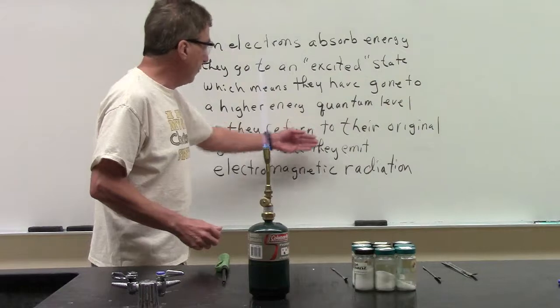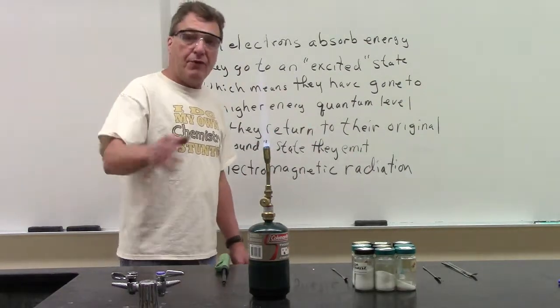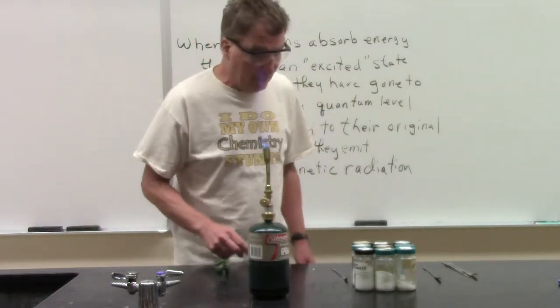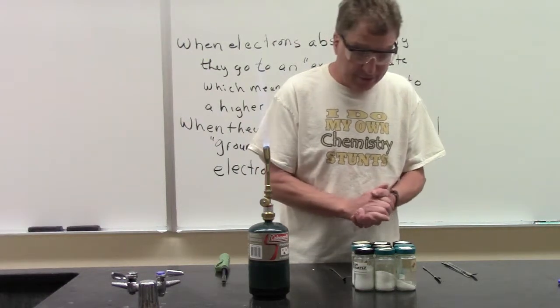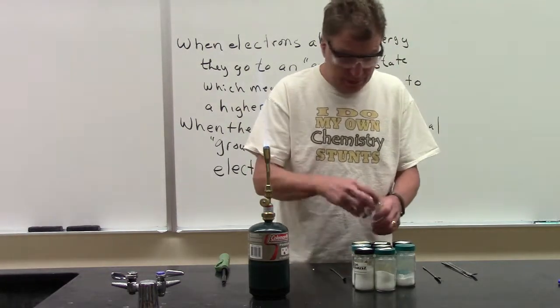So when they return to their original ground state, they emit electromagnetic radiation. Some of it we can see, some of it we can't. We're going to look at the ones we can see today, of course. So I have a number of different salts here that have different atoms that we're going to test. And so let's start.